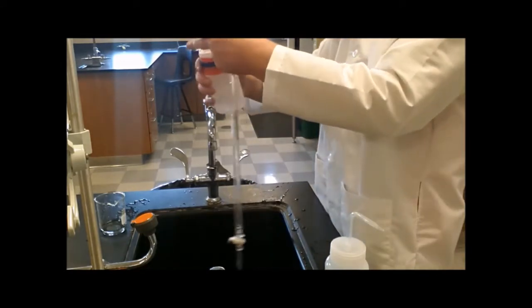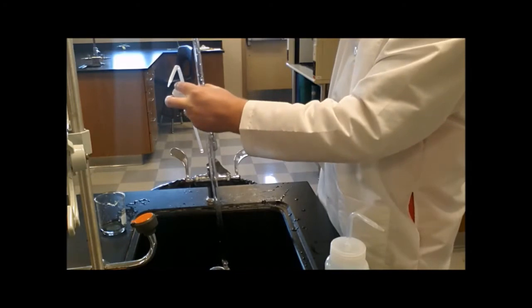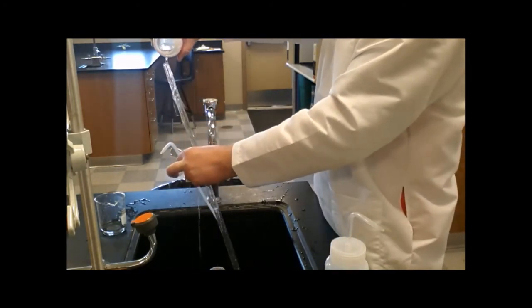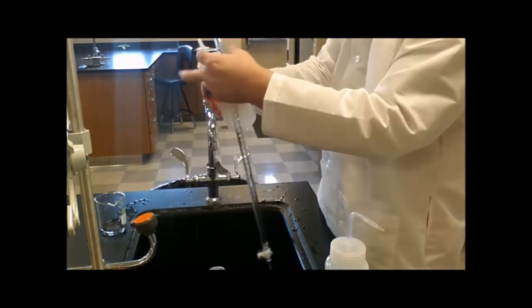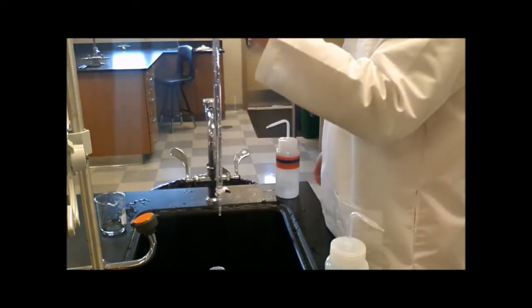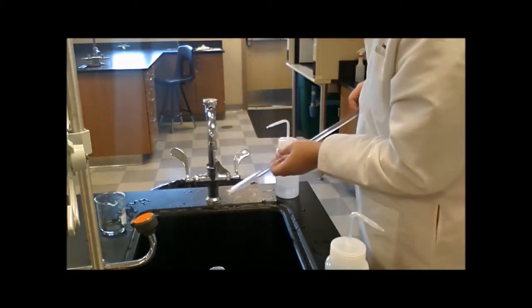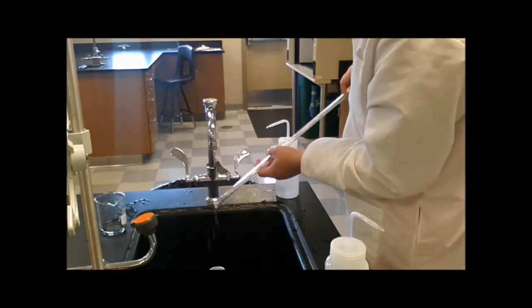Now you could fill it up using the squirt, or you could just take the top off the squirt bottle and just kind of dump it in there. You could do that too. What you want to do is rinse this out with deionized water. So now, this is nice. Twirling, twirling. Nice and clean.